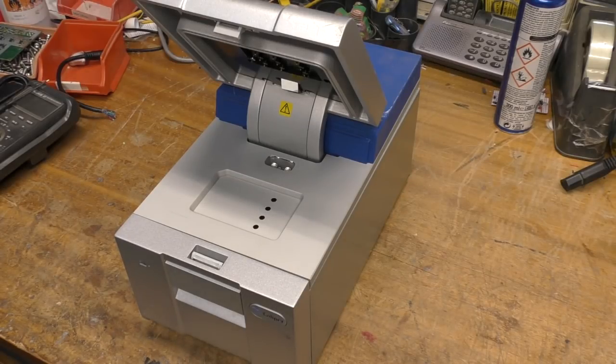The fact that this was cheap on eBay suggests, I'm assuming, this is probably an obsolete process that's been superseded by newer, faster, cheaper processes. Unlike the previous analyzer, I found the consumables don't seem to be quite so ridiculous.